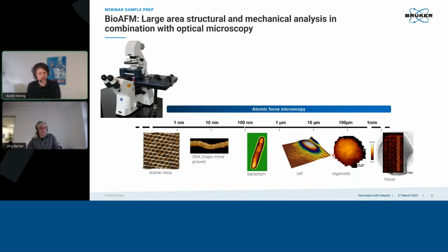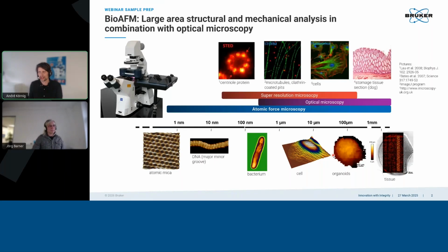I will show you some examples and also some protocols that might give you a starting point to investigate further what you need for your sample preparation. BioAFM is often combined with optical microscopy, and I will come to this topic too. Actually, I also have a combination of confocal and AFM imaging simultaneously.